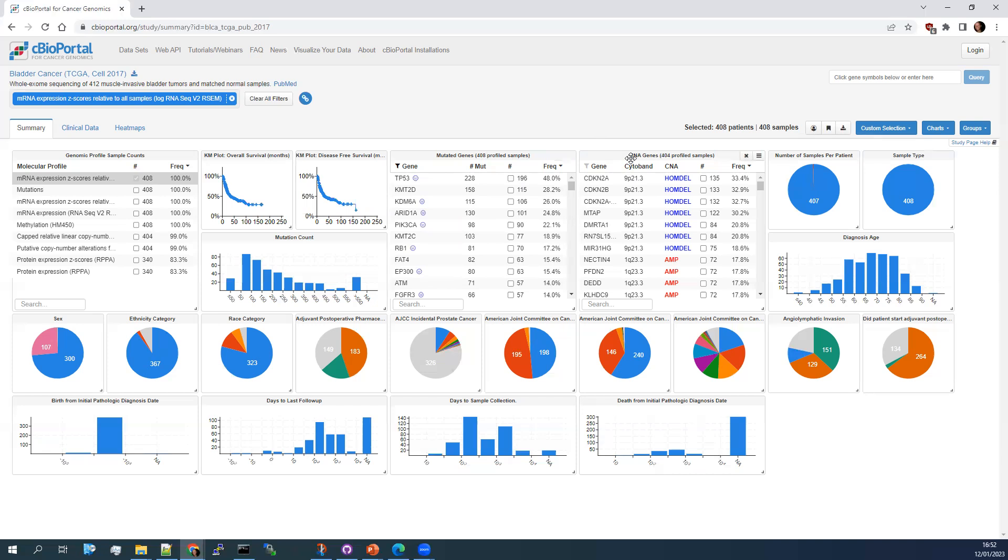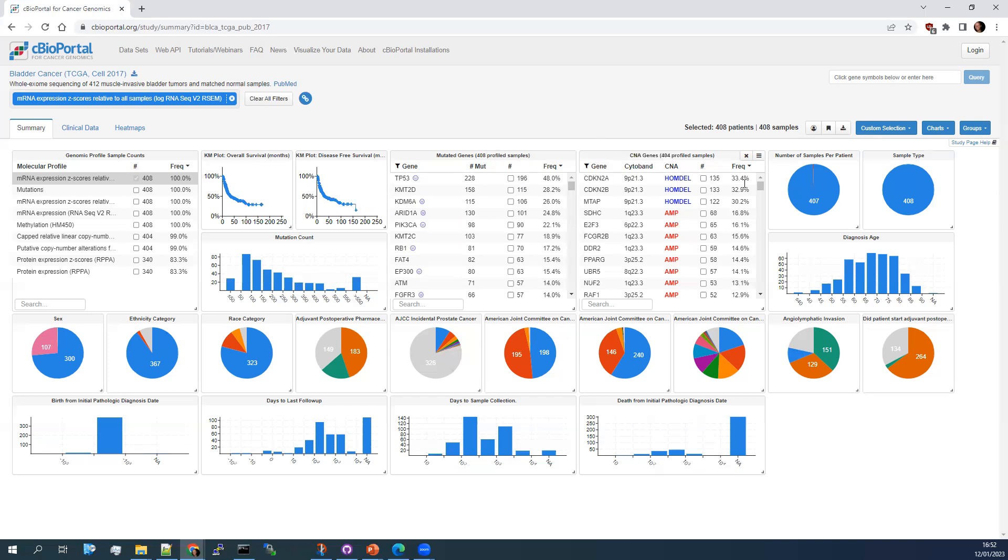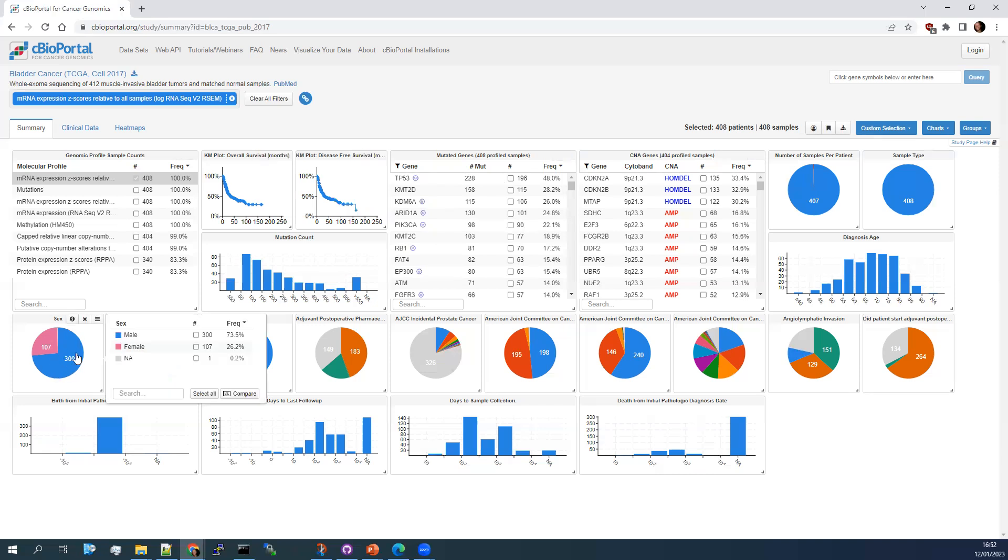You have a similar analysis here with the copy number alterations. Again, you can filter based on known regions. For example, in bladder cancer here, this 9P21 region is commonly deleted. So that's another one you can do if you wanted to start looking at some of the other categories.